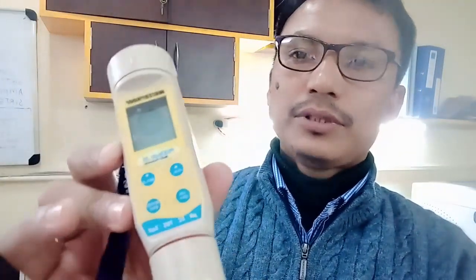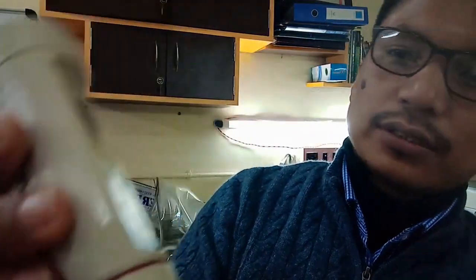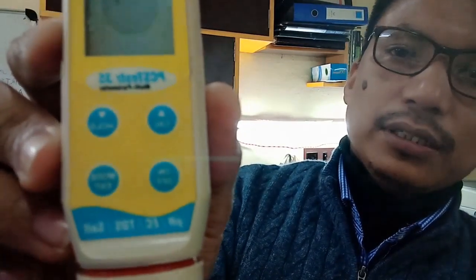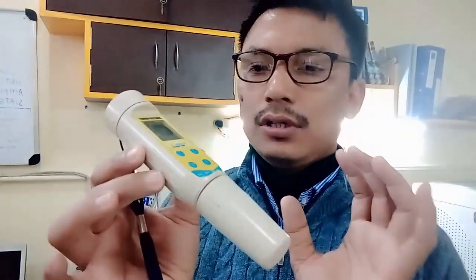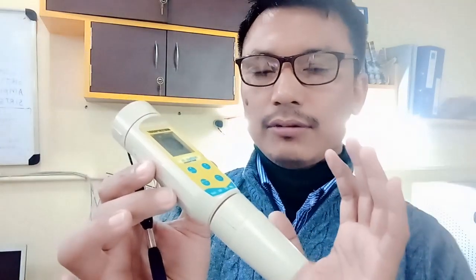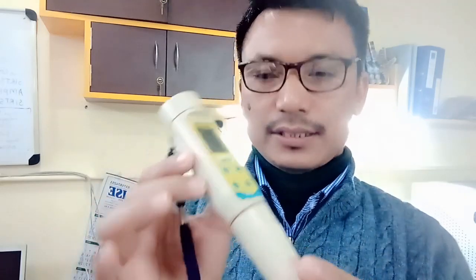So here you can see one of the devices, this portable device, which you can use. You can see the markings. First one is pH, second one is electrical conductivity, third one is TDS, total dissolved solids, and fourth one is the salinity. So in one device we can measure four parameters. So you can understand the portability and advantage we are getting using this device.